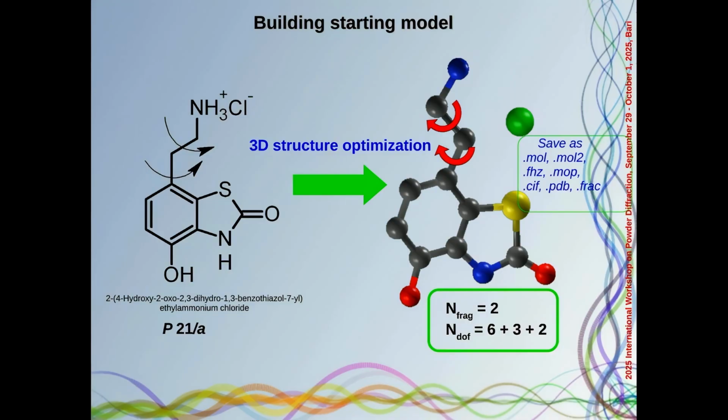So the only internal degrees of freedom modified are the torsion angles that can be rotated. You can't rotate, for example, a torsion angle inside a closed ring. In general, the configuration of a ring is not modified. So it's important that in the starting model, the configuration of angles and the ring conformation should match as close as possible that of the correct structure. So, okay.